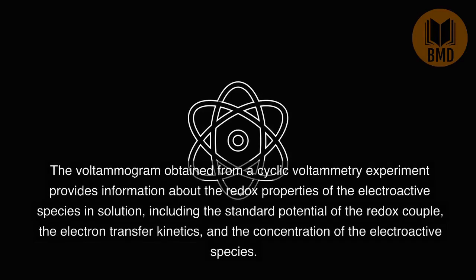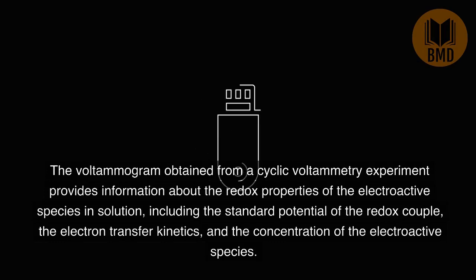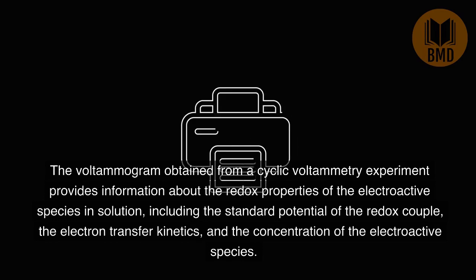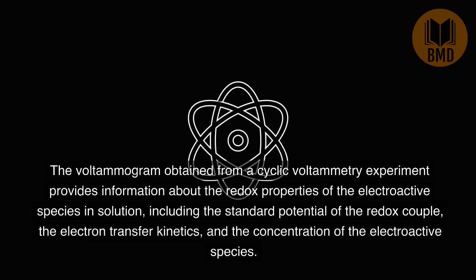The voltammogram obtained from a cyclic voltammetry experiment provides information about the redox properties of the electroactive species in solution, including the standard potential of the redox couple, the electron transfer kinetics, and the concentration of the electroactive species.